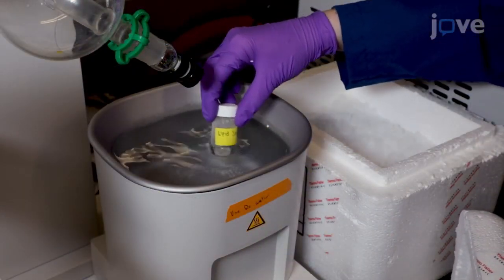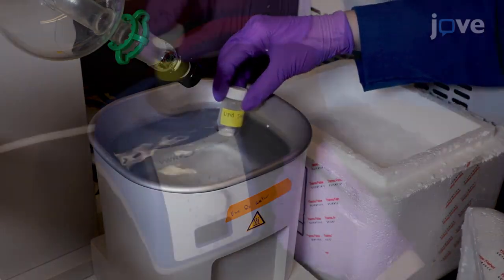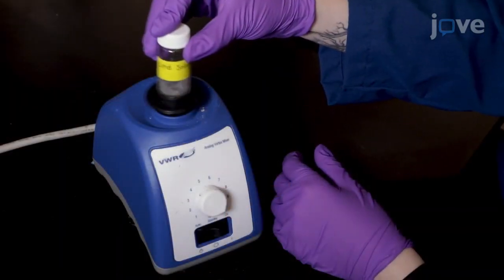thaw the suspension in a 30 to 40 degrees celsius water bath. Vortex the thawed vesicle suspension.